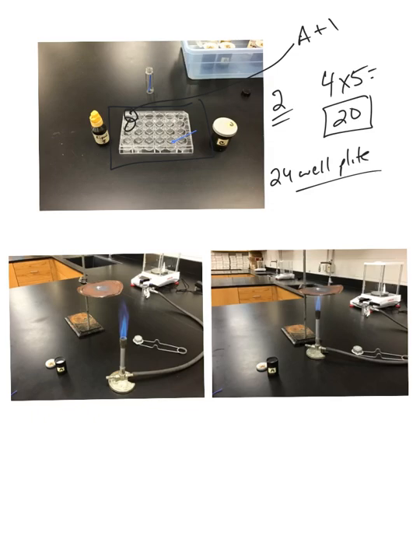Then you move to the very last thing, which is the third part of the lab, which is going to be how each of the powders responds to heat. So again, light the Bunsen burner safely. Make sure you check your ports and use a sparker. Once you've sparked it, make sure it has the nice blue flame as you can see here in the picture.